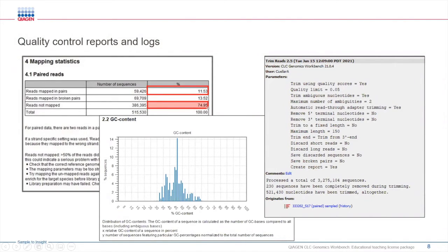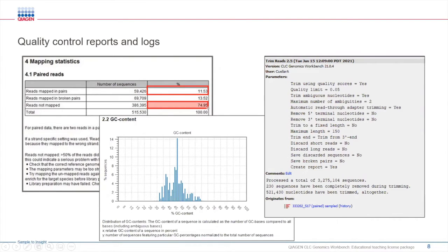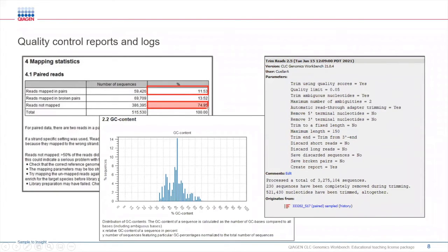CLC is going to flag to let you know that there may be something wrong with your reads. Taking this information into account, it can give you an idea of how the quality is within your reads and whether they could be used or not for further processing. In this case, you may consider not to use these reads since most of them don't map to your reference of interest.